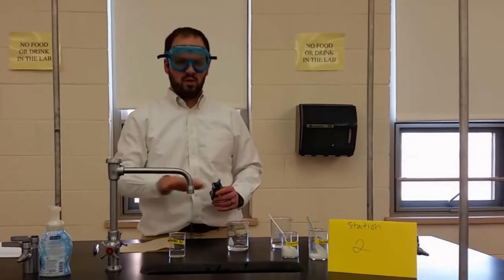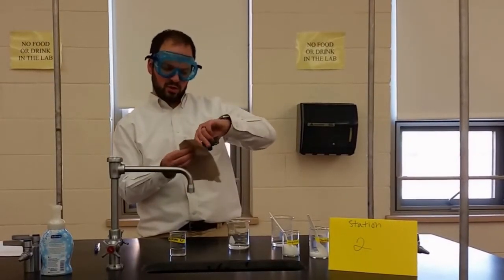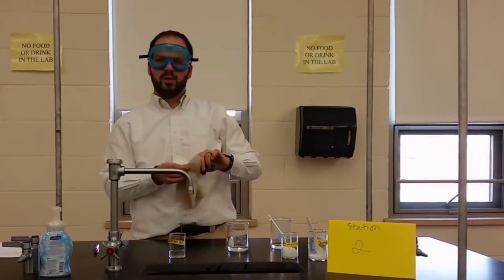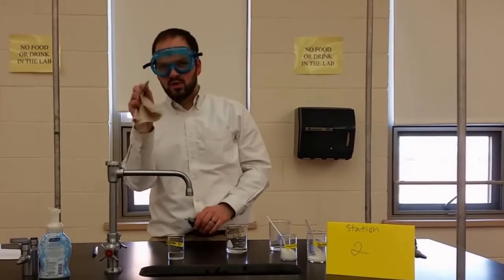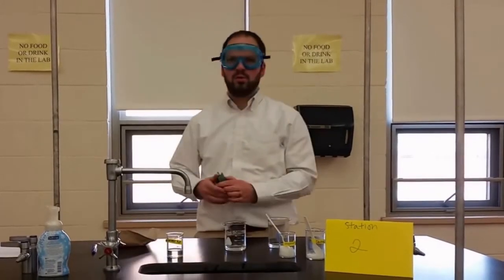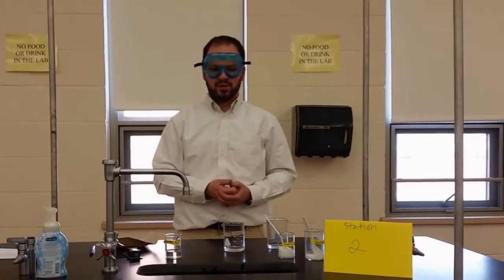An important part of this station is you've got to be very careful to avoid contamination between the different sources of chemicals at this lab. So we have a paper towel here at the station that we're going to use to wipe off the two metal probes between the stations. You might also want to get this just a little bit wet from the sink and use it to wipe it off, just to make sure there's absolutely no contamination that goes back and forth. That's the easiest way to spoil your results of this lab.